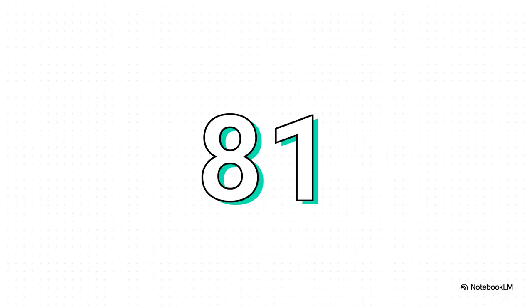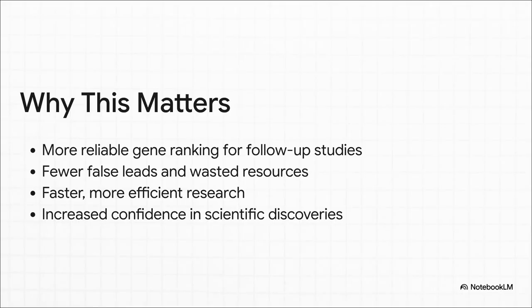They looked at the top 100 most changed genes from each half. Without shrinkage, you know how many genes were on both lists? Just 21. That's terrible. But with shrinkage, that number jumped to 81. 81! That's a night and day difference in reproducibility. So, what does this actually mean for science? Why is this such a big deal?